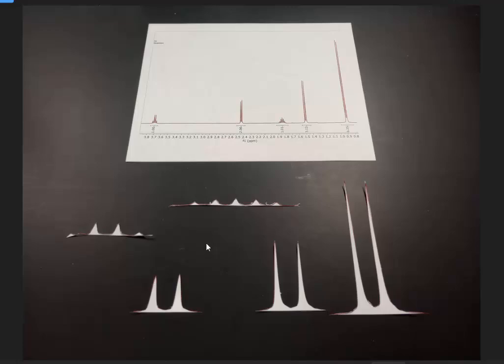So the same intensity axis for the y-axis and the same width in terms of chemical shift on the x-axis. In addition, I had to ensure that I had drawn a good baseline underneath each peak, and then to use an X-Acto knife to cut out the actual peak itself, trying to be consistent with the amount of paper that I had left over on either side.